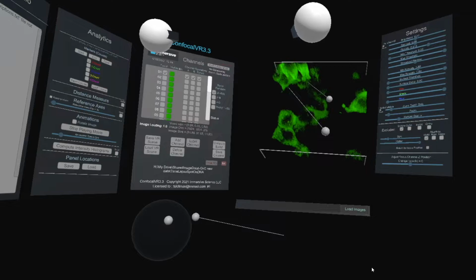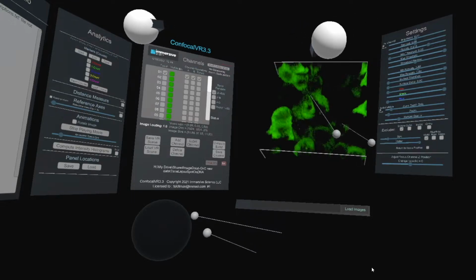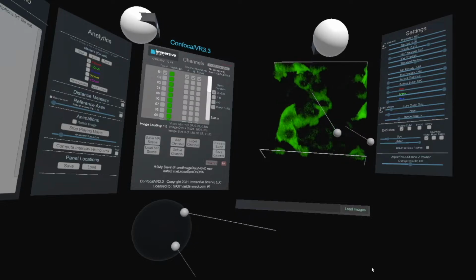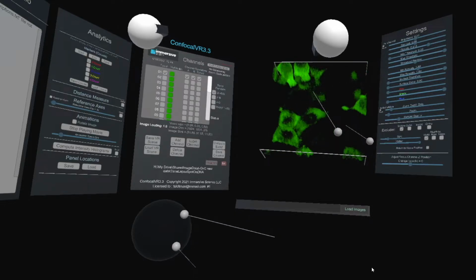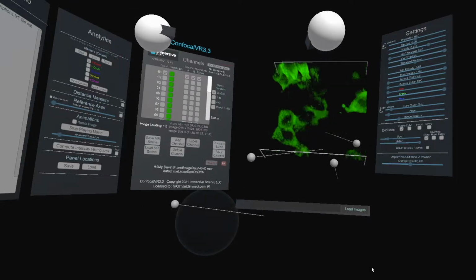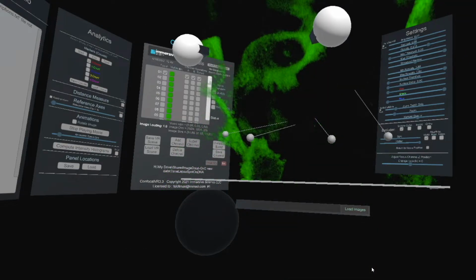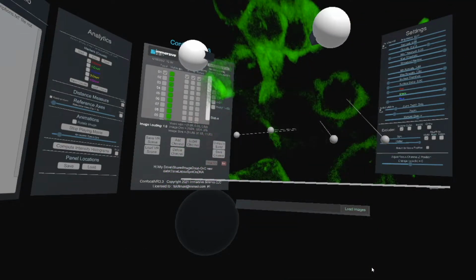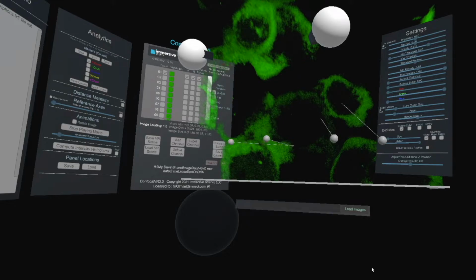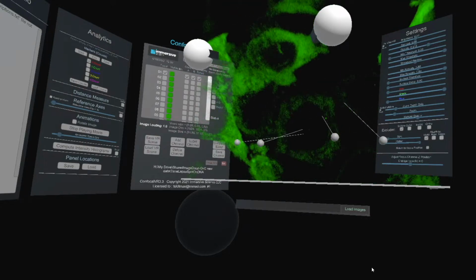So this is more or less the only way in which we can very easily, very quickly see what happens with spots. Where are they going to? How long are they there? I'm just going to make the image a little bigger for a second to see. So to our eye in VR, picking up this spot here and tracking it is really quite easy.